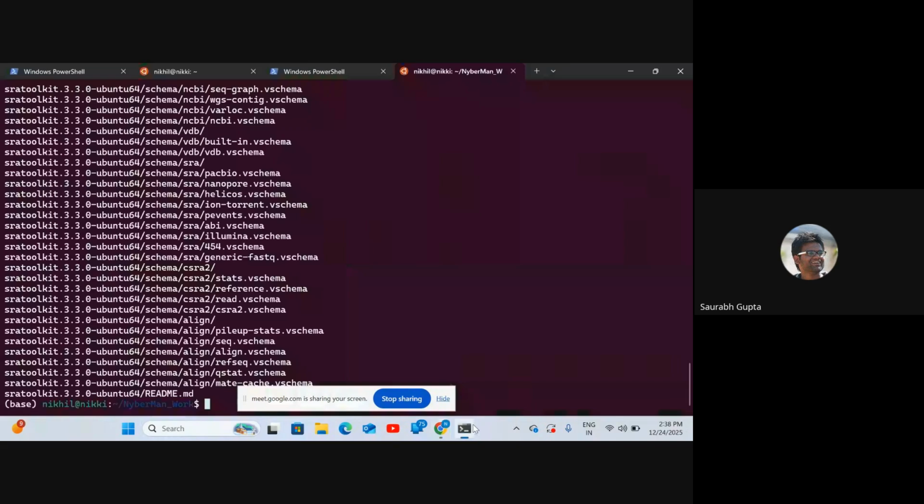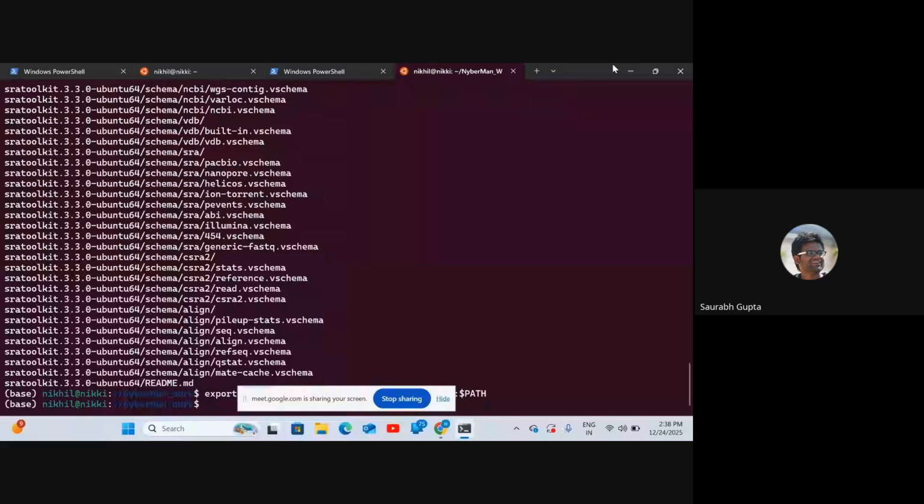And guys, I have updated the slides with all of this as well, so I'll be replacing the PDF that we have uploaded in the drive. Now run the prefetch command, the prefetch space SRR thing. Go to the chat.